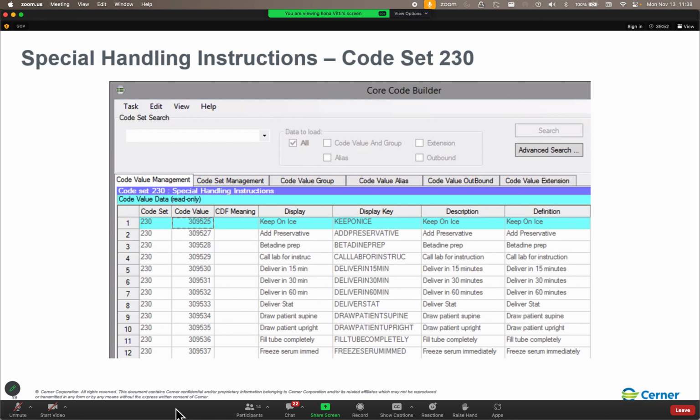Do we think that there is a guarantee in that 50 order power plan that has orders for laboratory and radiology and patient care and pharmacy and all of that, that we are guaranteed to get our lab orders in the same data packet we're sending to the netting server? What do you think? We're activating a 50 order power plan over in PowerChart. Yeah, Steven, you're right. No, there is no guarantee.